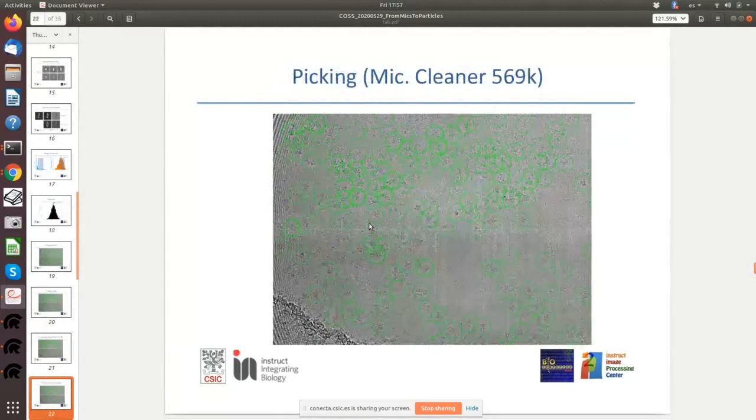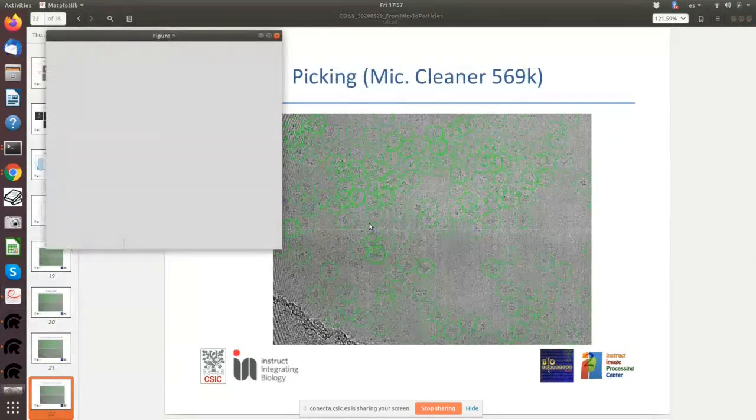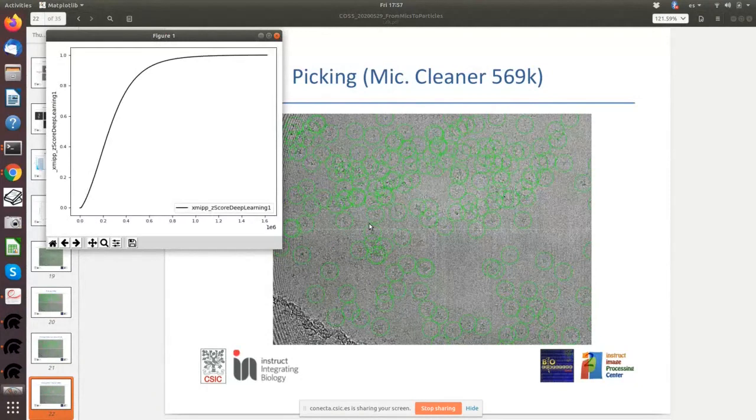And then we also have another, here is the plot. And here you see how to choose the threshold. Normally it is somewhere where there is a change of regime, so it would be somewhere around here. This is 0.94, 95. I chose 0.99. So I chose something like this, just the flat part of all the coordinates.